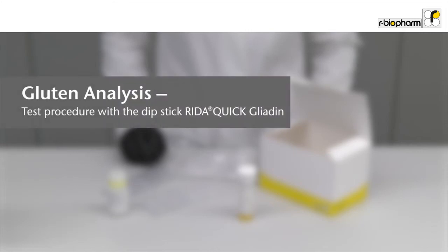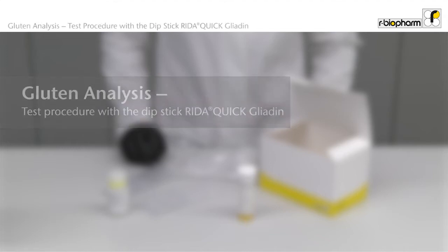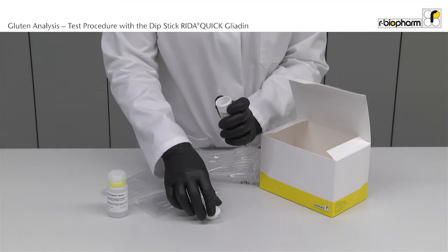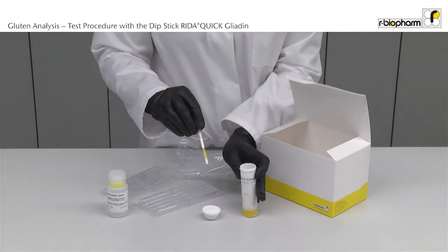Gluten analysis. Test procedure with a dipstick RIDAQUIC GLIADINE. The analysis is very user friendly and takes only five minutes. The test kit RIDAQUIC GLIADINE contains 25 dipsticks in a container, buffer vials and pipettes.